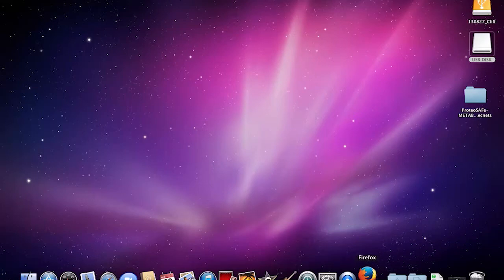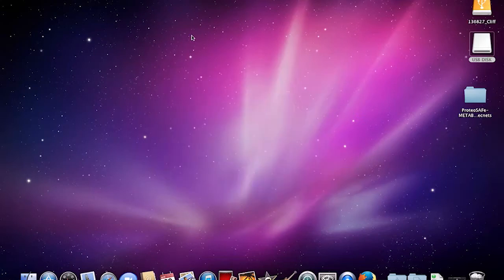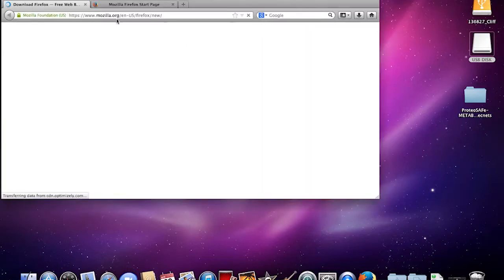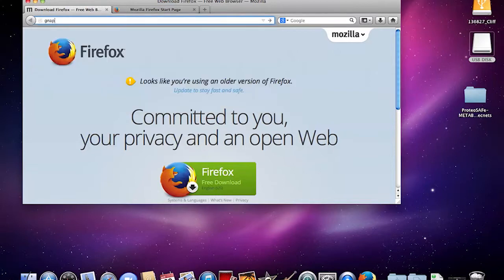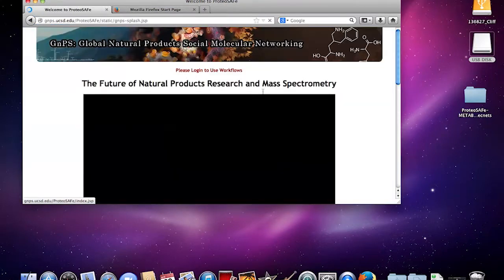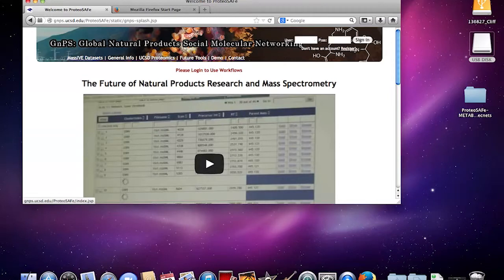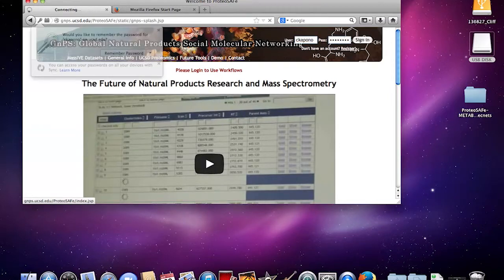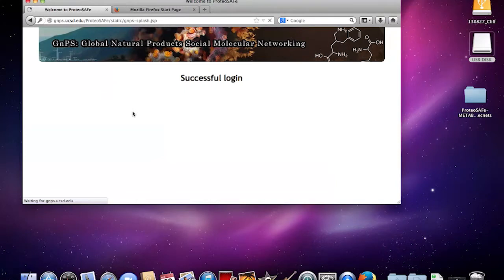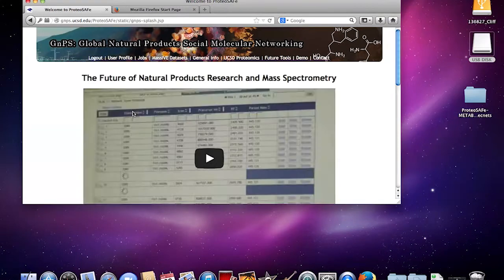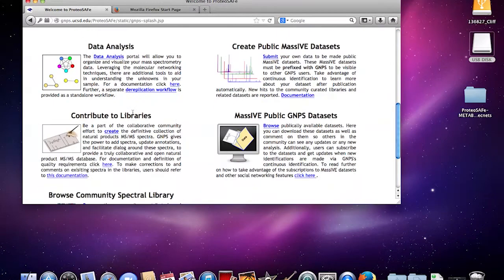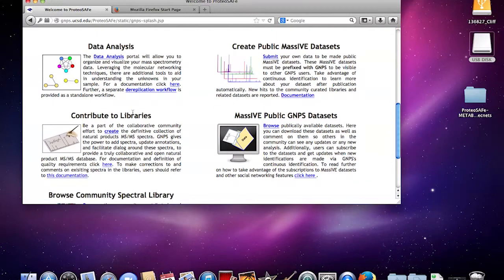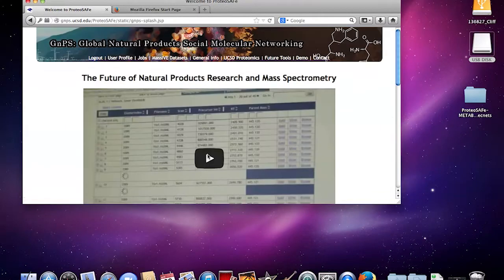Once you open up Firefox, you're going to want to go to gnps.ucsd.edu and log in. All the documentation is found on the first webpage when you log in. In terms of contributing to libraries, you can find documentation here to support this video.